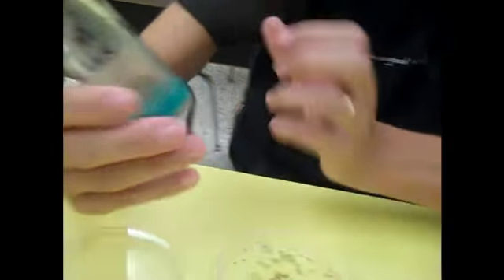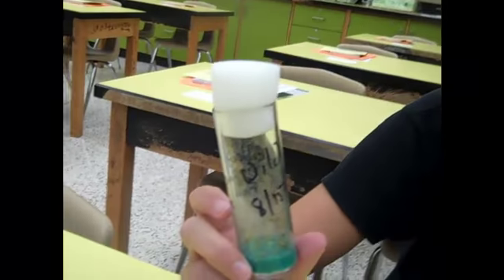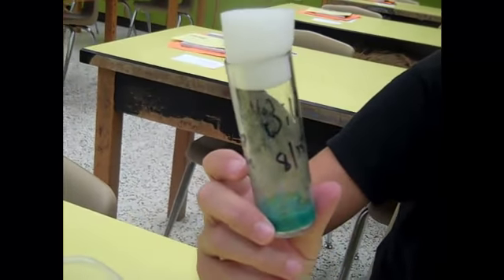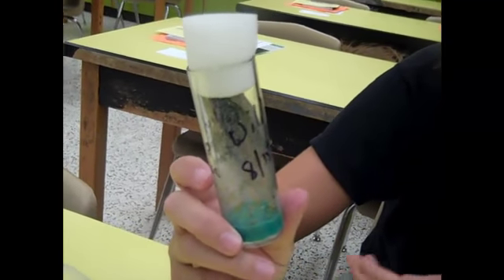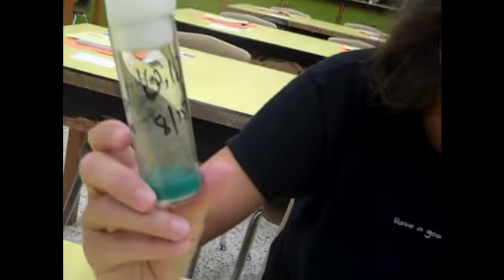So what we would do with this vial now is we would wait, and we would check this, and it's very important that once 8 hours passes from this point, we come in and check it to see if there's any females in there, because if we go much past 8 hours, if there are any males that also emerge from these pupa in here, then they will likely mate with each other. There's only about 8 hours from when the females emerge that they are not receptive to males. After 8 hours, they could be mating in there, and that won't do us any good. So we've got to come back and check this, and this is part of your lab grade, that you will come back and check your vials regularly for females.